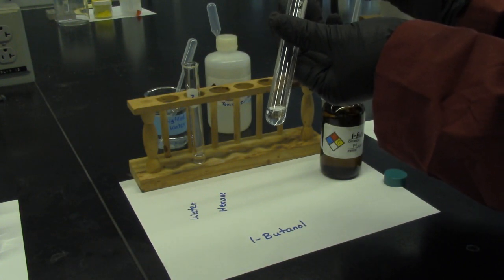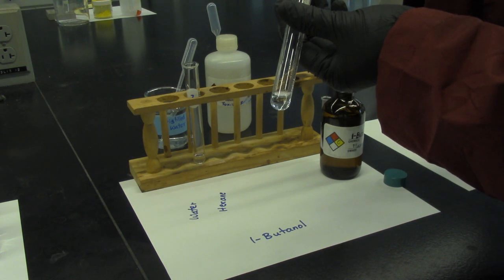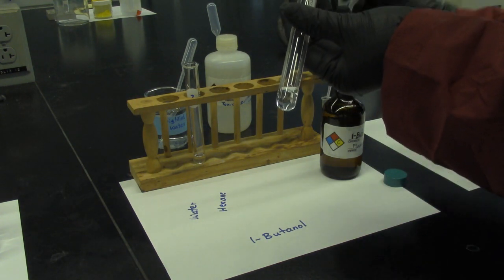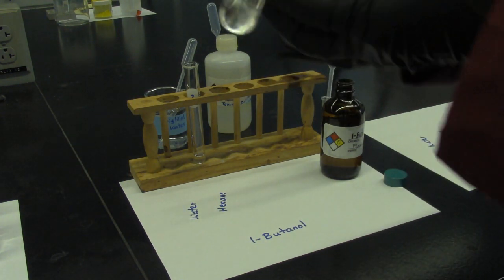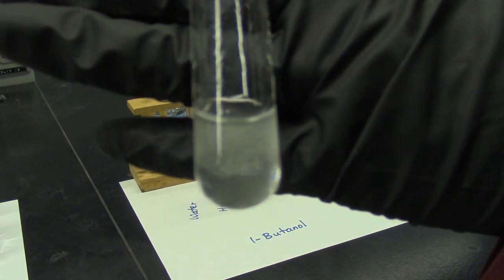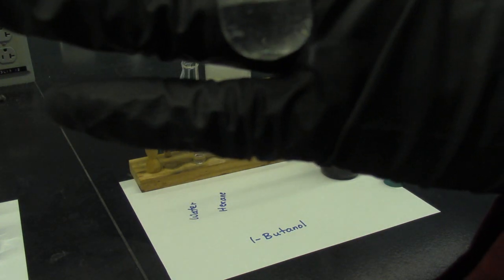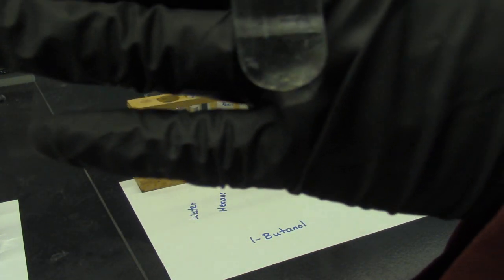Add more butanol, 6, 7, up to 20, and shake it. Write down the observation. See the line?